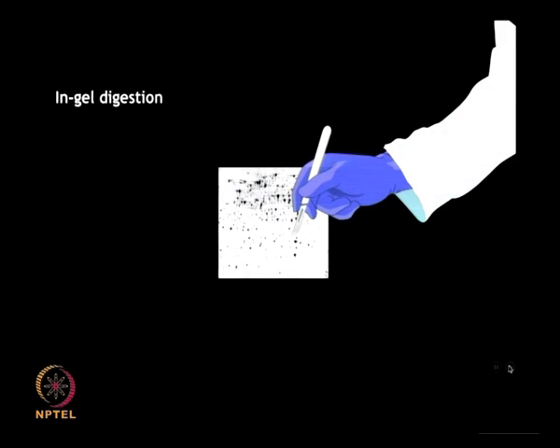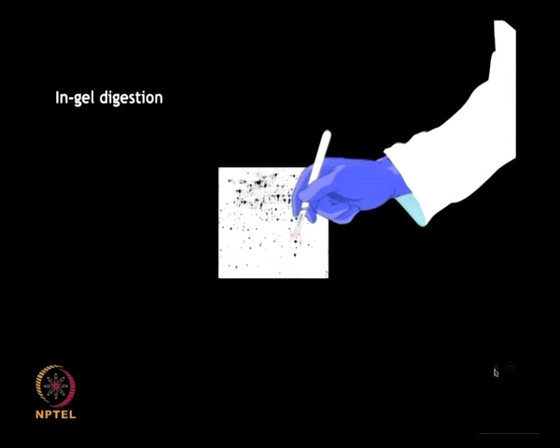Sample preparation and spotting. The protein sample must be prepared suitably before it can be analyzed by the mass spectrometer. If you have run a 2D gel, first of all the purified protein of interest needs to be excised from the gel on which it has been electrophoresed and dissolved in a suitable buffer.